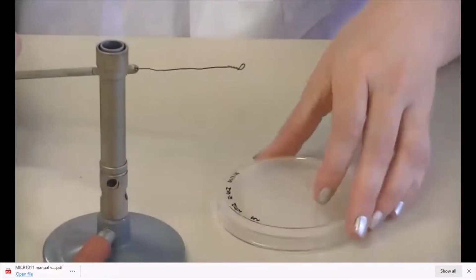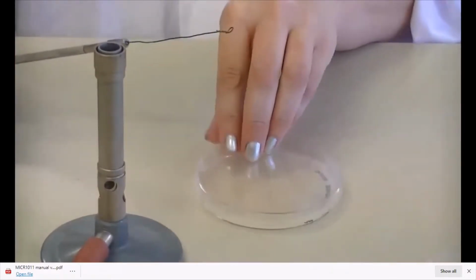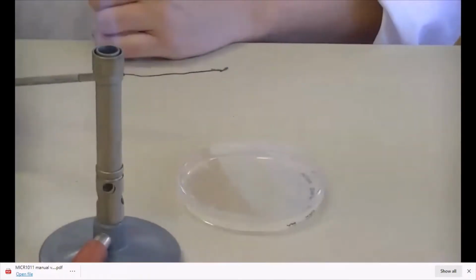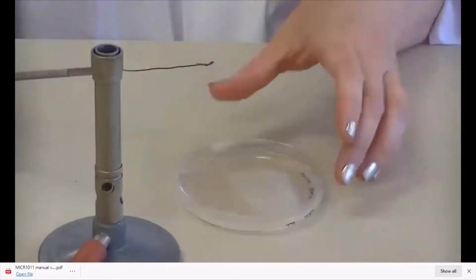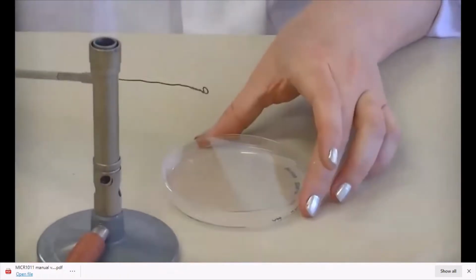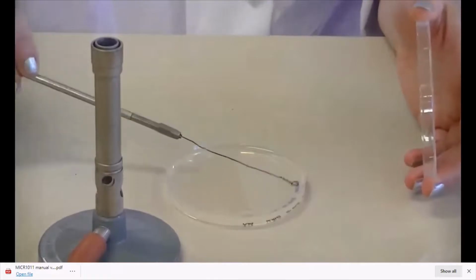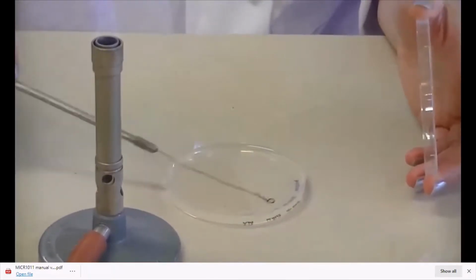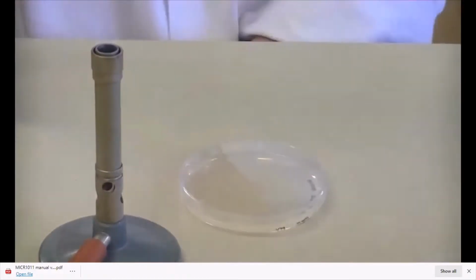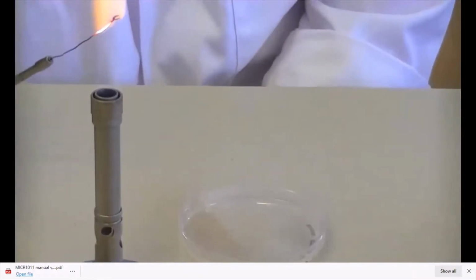Remember, when you labelled your plate, it was upside down, so you need to turn it now the right way up. If you feel uncomfortable when streaking, you can actually draw the streak lines as per your diagram onto the bottom of the plate. For this demonstration, I'm not going to do that because it will obstruct the view. Now I have my colony on my loop. I'm going to perform the primary streaks. You move your loop with the bacteria on it back and forth onto the surface of the agar. That has to be done very gently so that you don't tear the agar. The agar is hard, but it is like a jelly substance and it can easily tear.